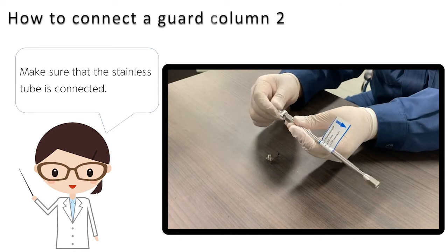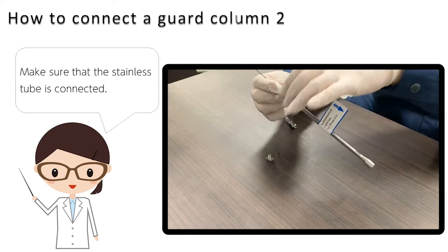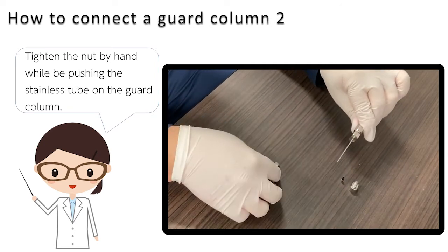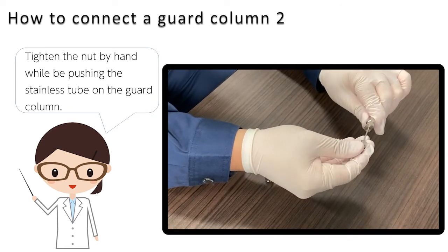Make sure that the stainless tube is connected. Tighten the nut by hand while pushing the stainless tube onto the guard column.